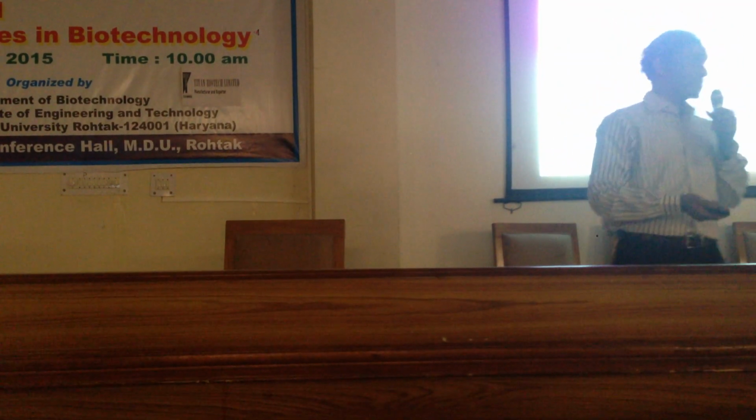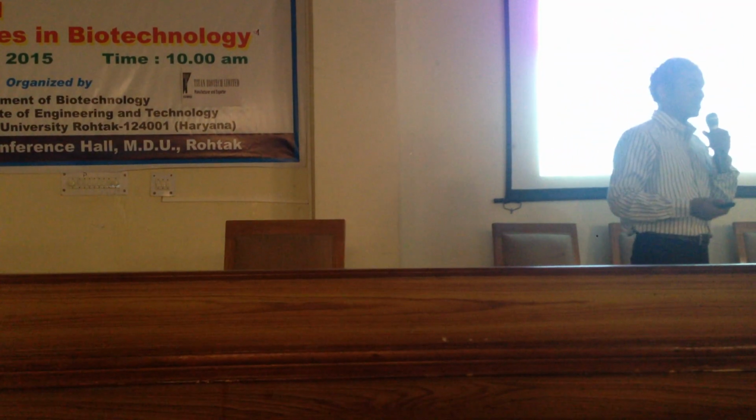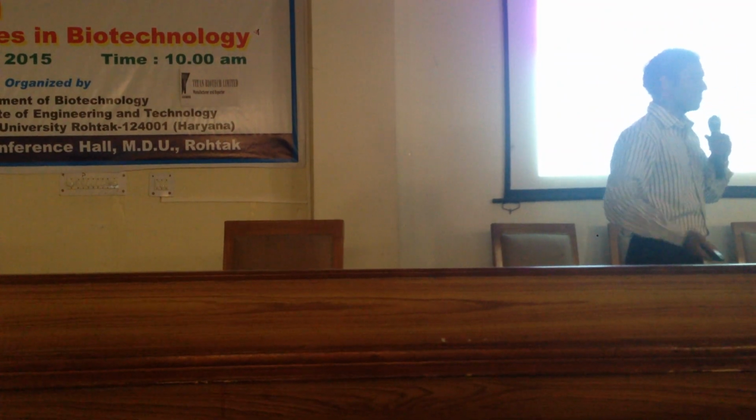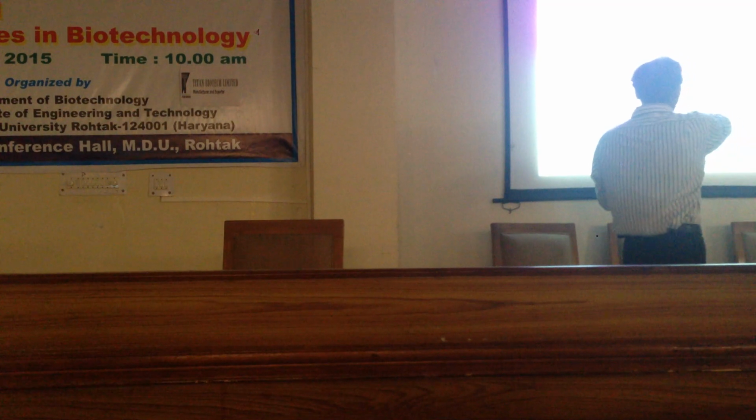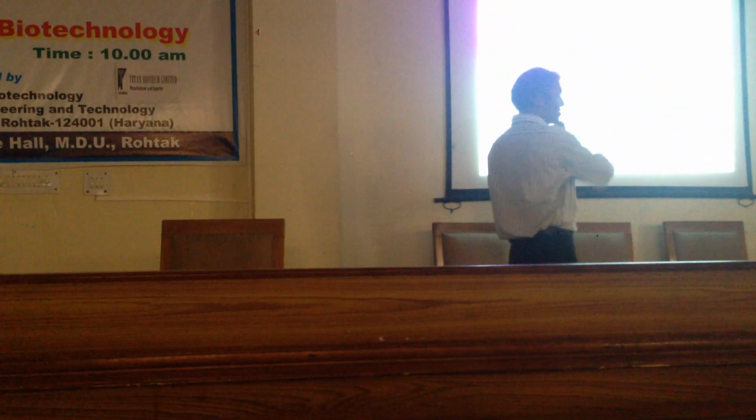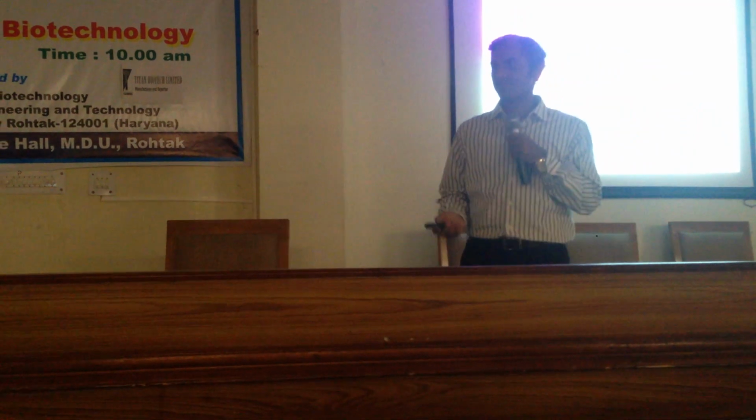Sanger's is a technology which still holds some potential, and the coming technologies are built upon Sanger's, Fred Sanger. So we won't discuss Maxam and Gilbert, we'll discuss Sanger's technology.